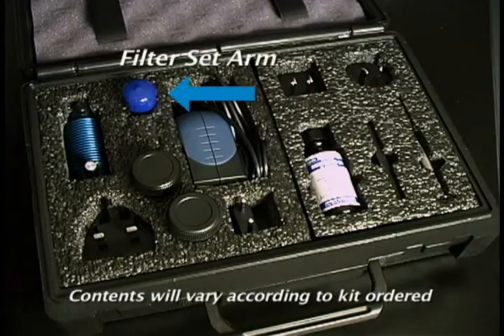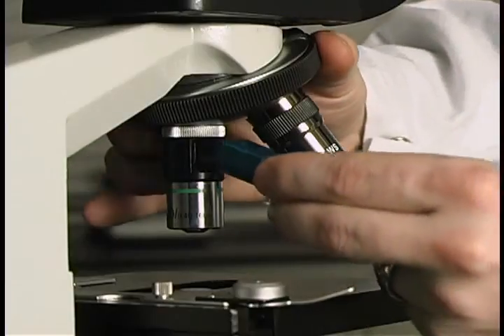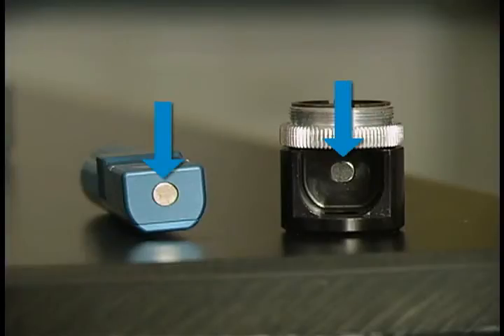The filter set arm, which houses the functional components of the Paralyns Advance, is inserted into the Paralyns Advance body and held securely in place by a magnetic connection.